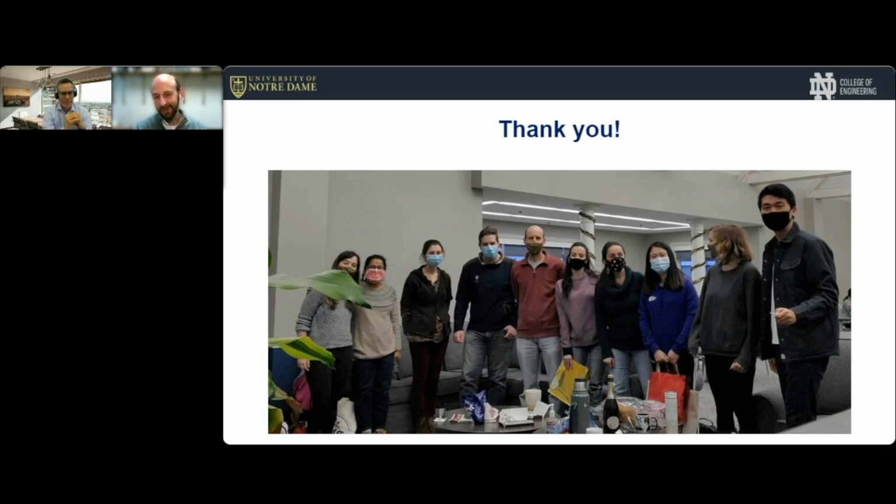Michael, thank you very much for the kind comments and for the question. I assume you know the answer to this question as well, but of course, there are a number of image processing tools that can be used for the OCT images. I think we did a lot of ImageJ, Fiji, MATLAB add-ons. I couldn't say specifically the ones that we've been using, but I'd be happy to discuss later on or refer you to some papers where we have this information.